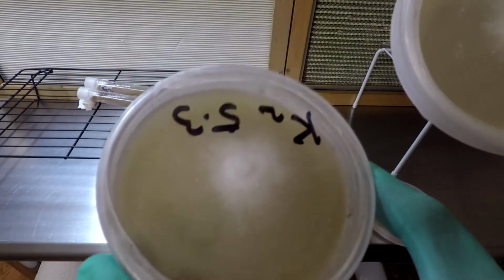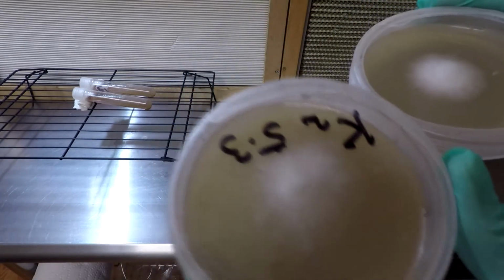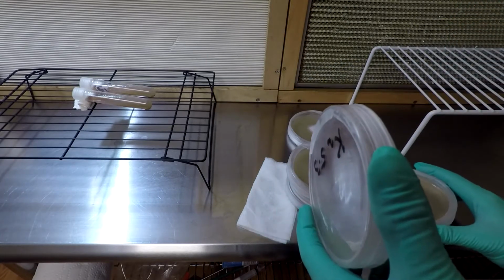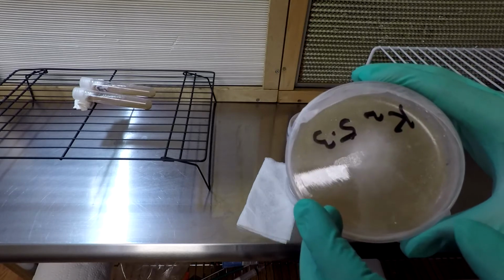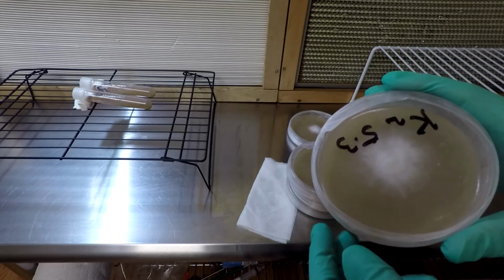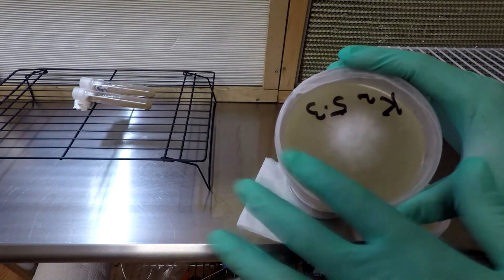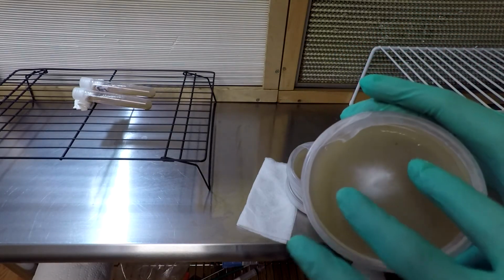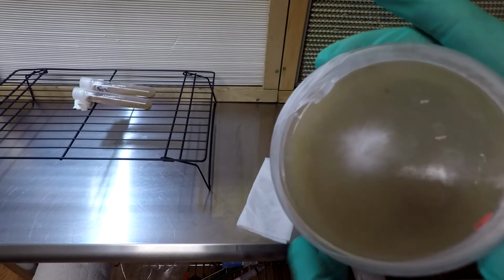Now these two, you can see they've grown out pretty far, but notice they're not dense white. At least not as dense as the other ones. Now, for oyster mushrooms, that is not necessarily a bad thing. And in the past, I would have selected the fastest growing dish, even if it didn't look cottony white. That's because the faster it grows, it's going to colonize your spawn or straw or cottonseed hulls much faster. And of course, that's also the same reason why it's not so dense white, because the mycelium has spread out more thinly. But usually the rule of thumb is you want a nice fast growing but nice thick white. That's pretty much for any strain of mushrooms you're trying to do an isolate from.